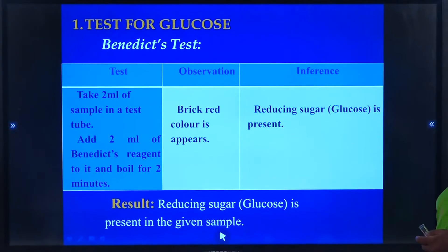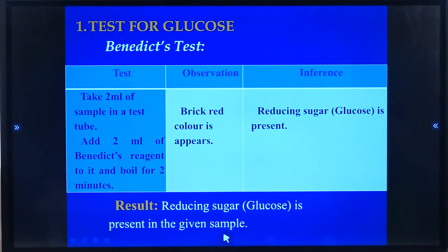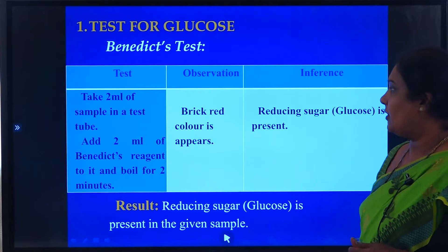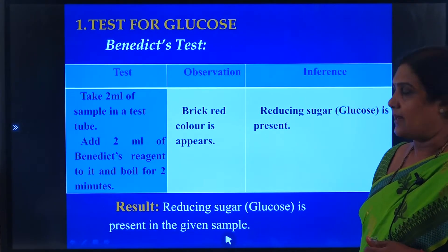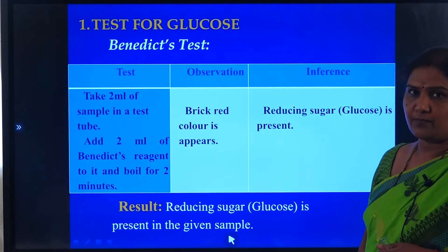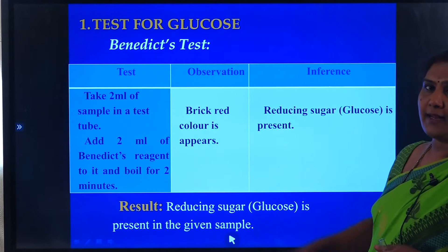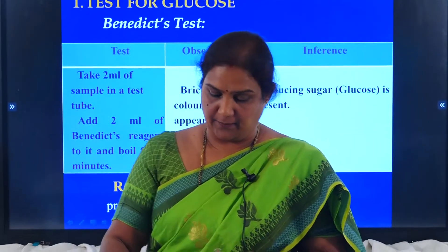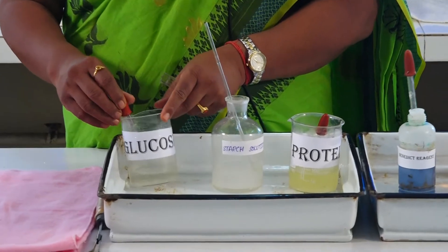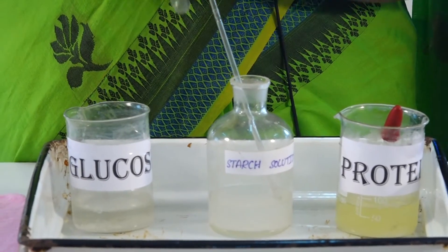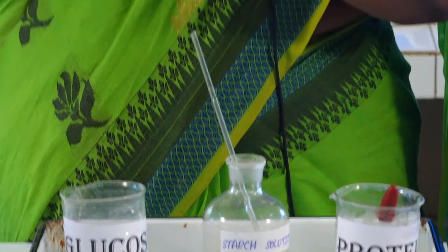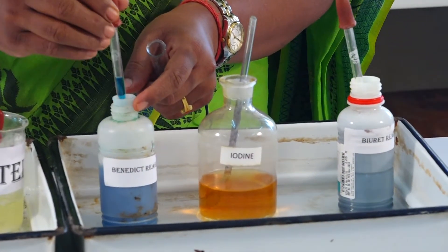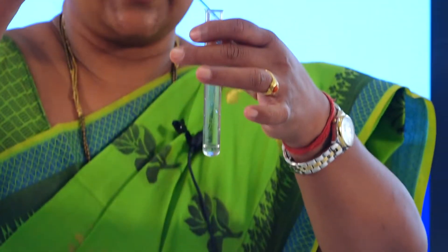What would be the procedure? In the experiment, we take around 2 ml of the sample in a test tube, then we add around 2 ml of Benedict's reagent to that test tube, then we boil it for a span of about 2 to 3 minutes. Here, I am just taking 2 ml of the sample and adding 2 ml of Benedict's reagent.